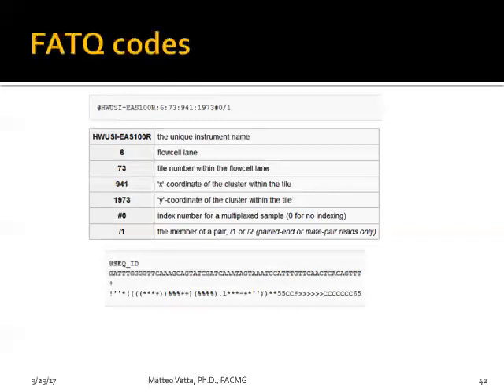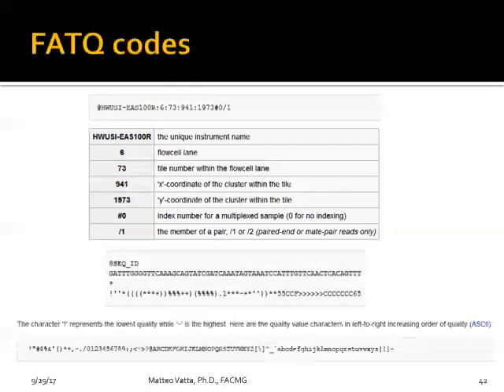One thing that everybody needs to keep in mind is that when we have a sequence, every letter of the sequence will be paired with a certain symbol. And this symbol represents actually the quality, so how good quality for each data point has been obtained. So the exclamation mark represents the lowest quality, while this symbol represents the highest quality. And then everything is in between.